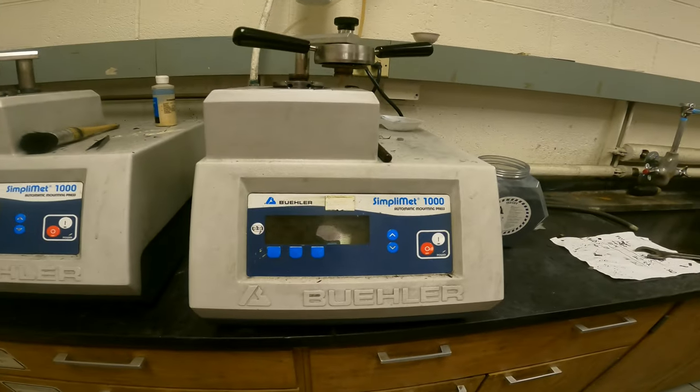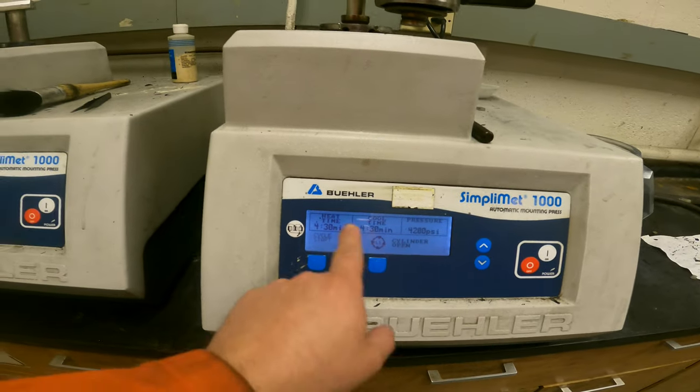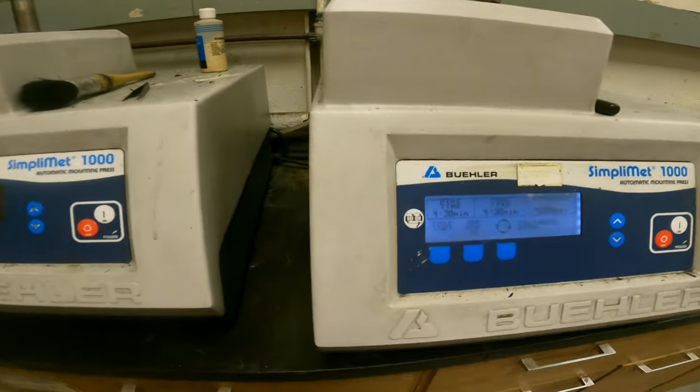Okay, so these are the mounting presses that we're going to use. Buehler machines, they already have some configuration here, so we don't need to change any of that. They are already configured, both of them.